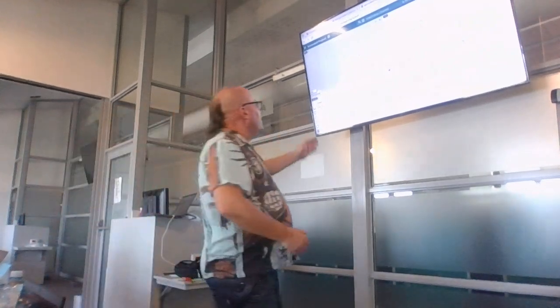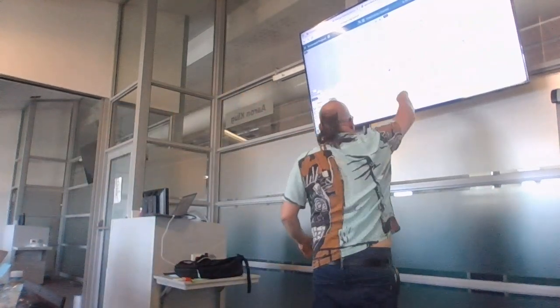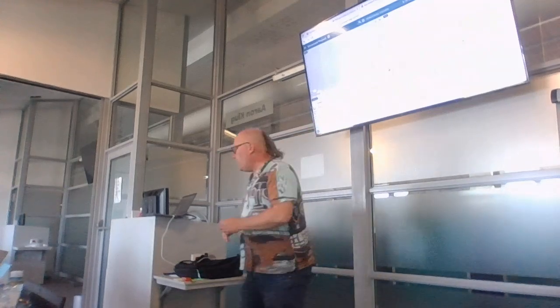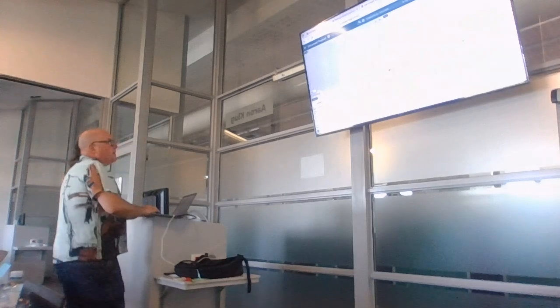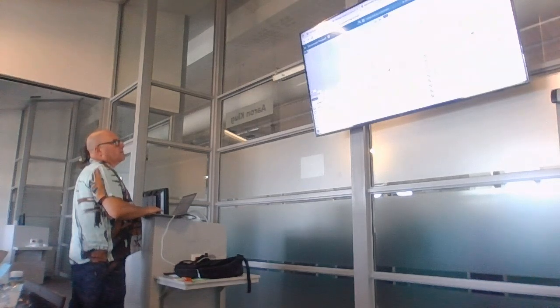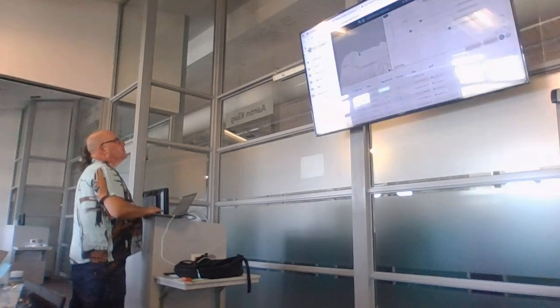you can actually make it do a timeline. I just can't remember how to do that now, but I think it might be because of my dates. Maybe you can do that. But we don't have a tree file, do we? The SNP, it's a phylogenetic tree, it's not a time tree.